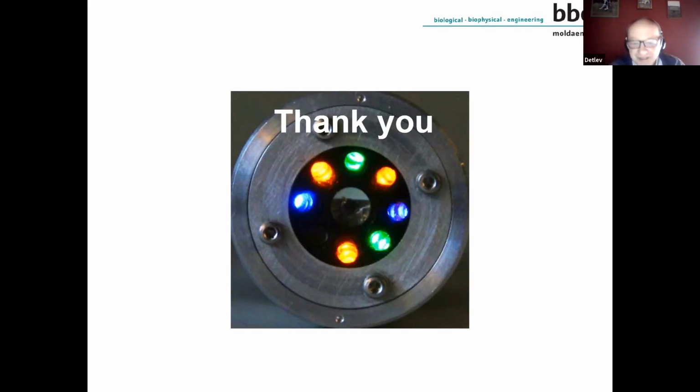So when you see something like a dying bloom, you do not need a fluorometer. A fluorometer is for when you want to see the dynamics or the development of the algae. When you have a massive bloom, you can see it by visual inspection with your naked eyes.